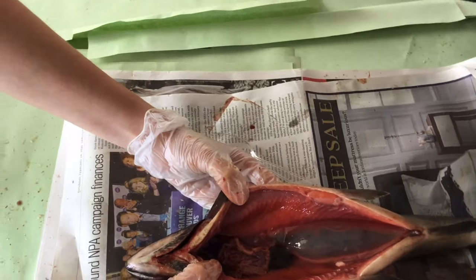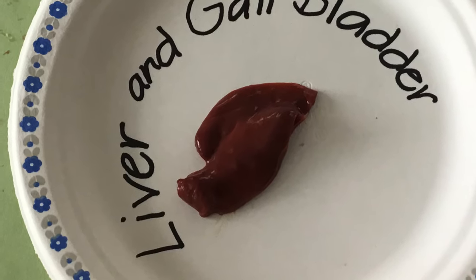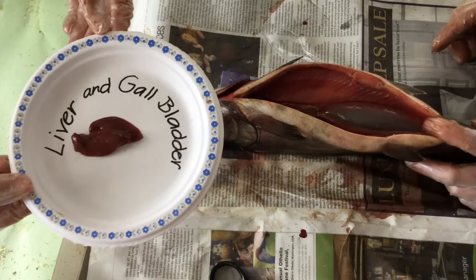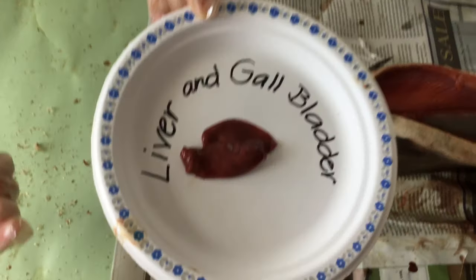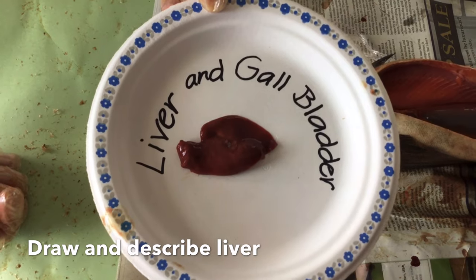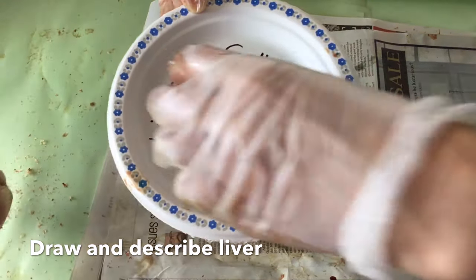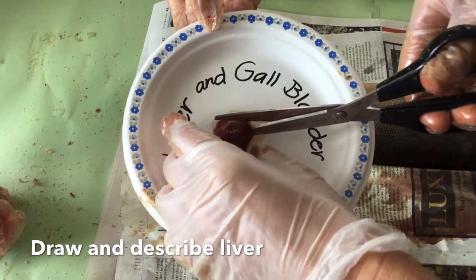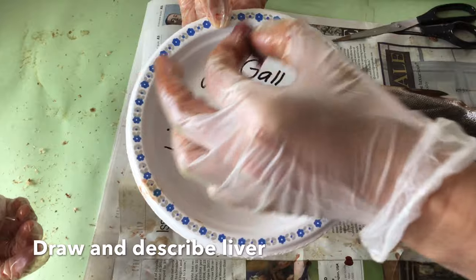The liver. Right now, in your booklet, you are going to draw the liver in the space provided, then describe its color and texture. Miss Anima, could you cut open so we can see what the liver looks like on the inside, and you can describe that as well in the place indicated.